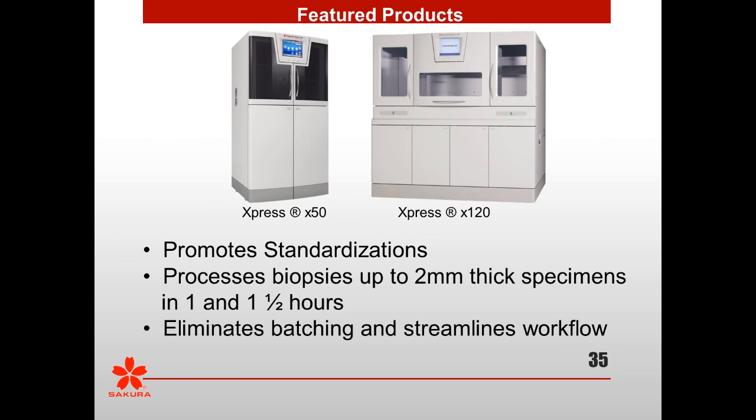Thank you. The next question is, isn't it true that the reagents are proprietary? Well, both of us can answer that. Yes. I will tell you that the reagent pack, and I am a user of the Express 120, is a proprietary pack. So if you're using a conventional processor, how many gallons do you use? For 900 plus resection specimens or cassettes, or 1,200 plus biopsy cassettes, I use 2 gallons of a proprietary solution.